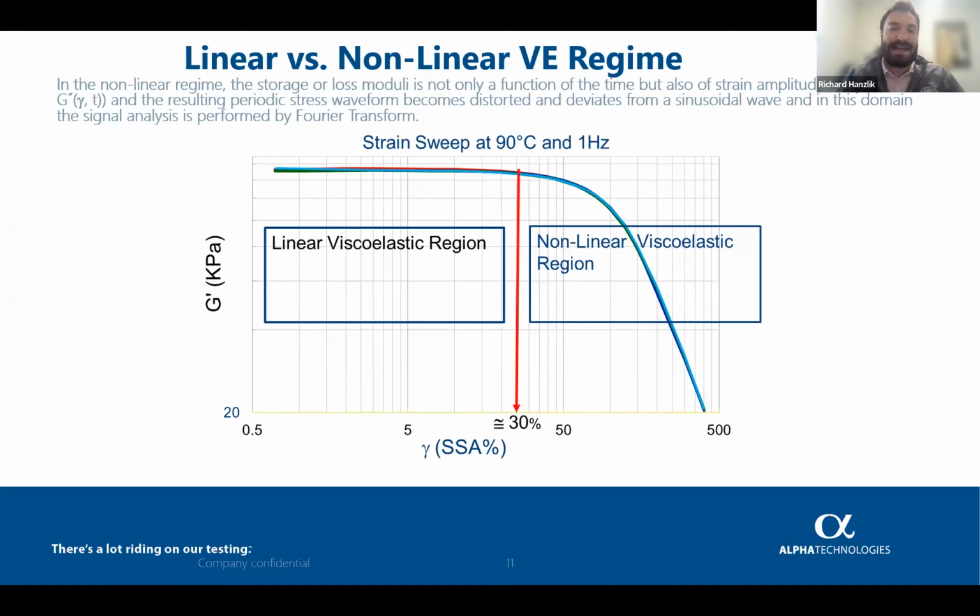Typically, this area is not going to change too much in response to frequency. However, it will respond more to strain. And when we get into the Fourier transform analysis, we look more at shear rate, but we'll get to that in a second.